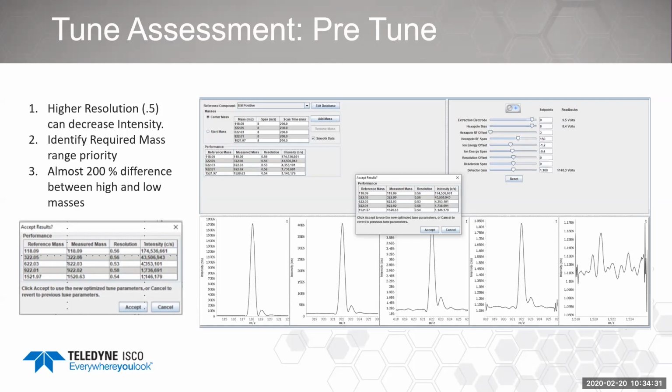Or, I've seen this too, maybe your tune solution's bad. We're actually running into that with the question of a bad batch, not something we provide, but someone was just using a tune mix that was not shipped properly from the factory, and it had some anomalies in it. So always just go back, maybe try another tune solution, see if you have anything that's a known good response, and then go from there.